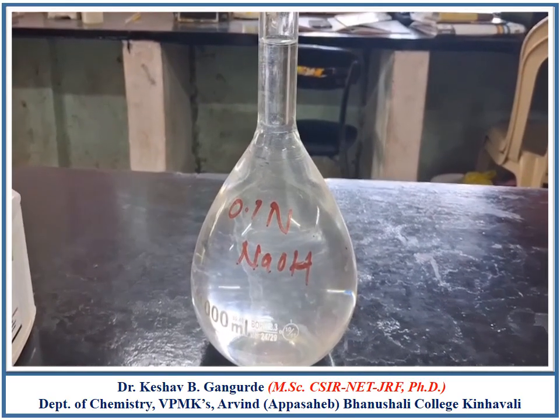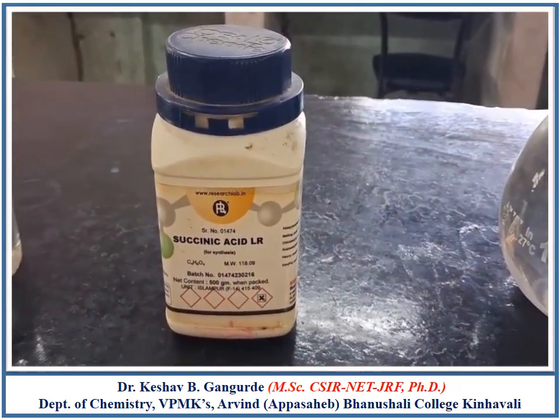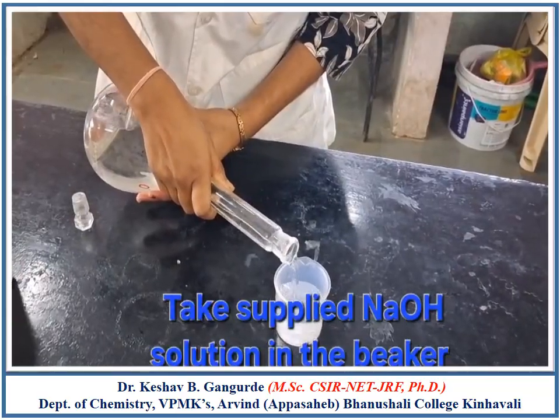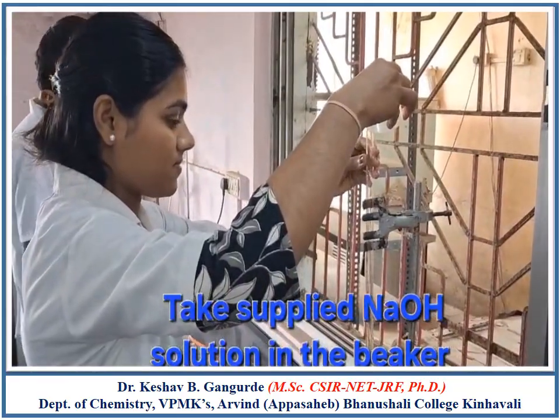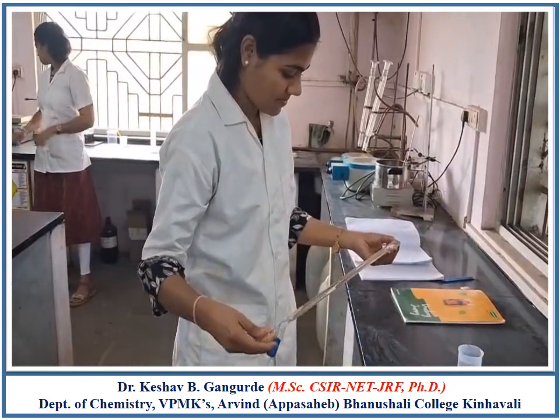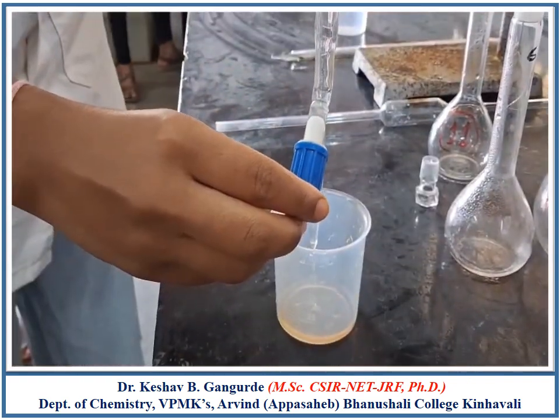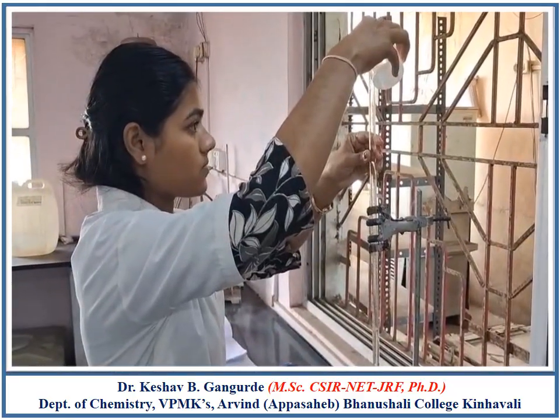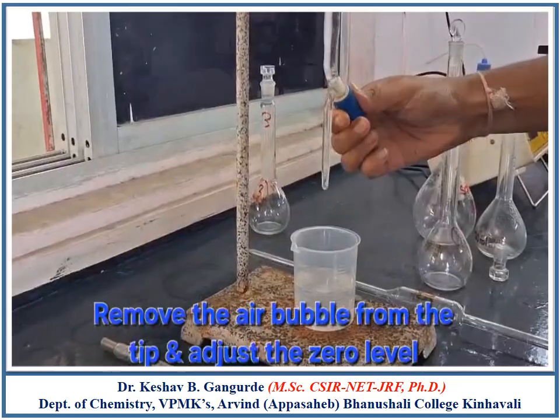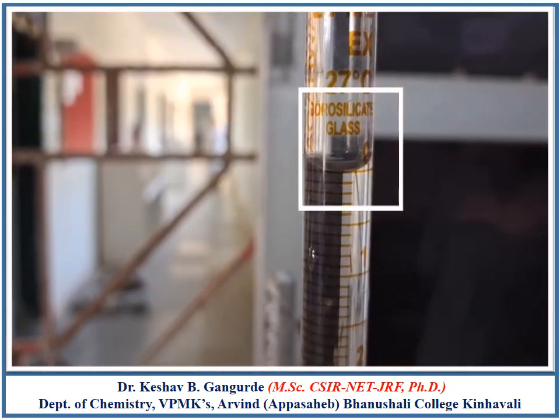Let's do the standardization of the given NaOH solution by using succinic acid solution. Take the given NaOH solution in the beaker. First, rinse the burette with the given NaOH solution. Now fill the burette with NaOH solution up to the mark. Remove the air bubble from the tip and adjust the zero level.